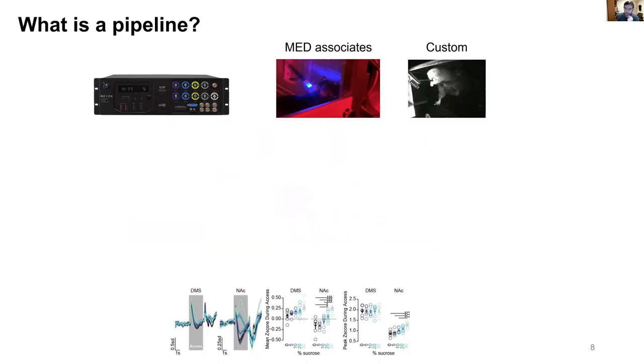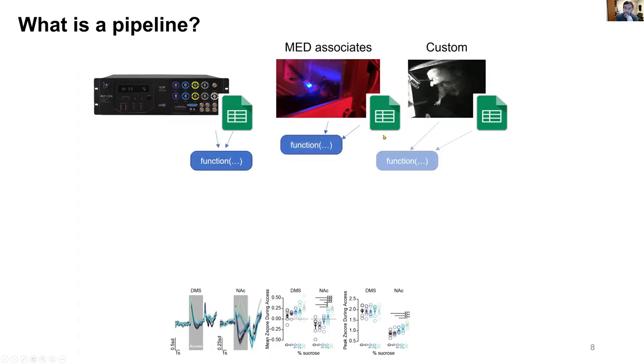And the ideal case that I've worked towards myself, definitely not quite there yet, but it's getting closer every day, is to have instead a systematically recorded data log for each type of data, and then single functions that are executed by a single analysis sheet. So from one analysis sheet, you can call functions to do all these operations. That way, it's very systematic and easy to track the data points that you've created.